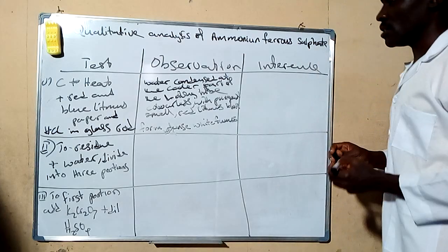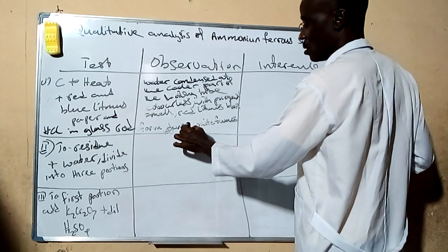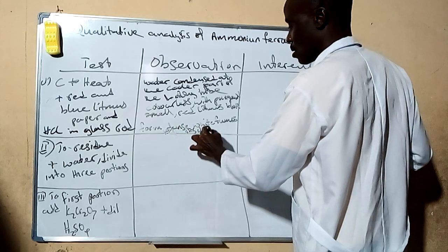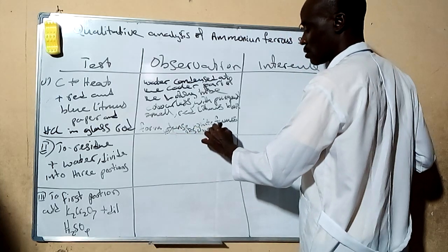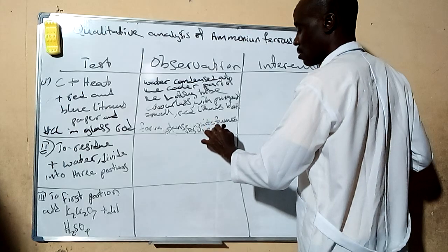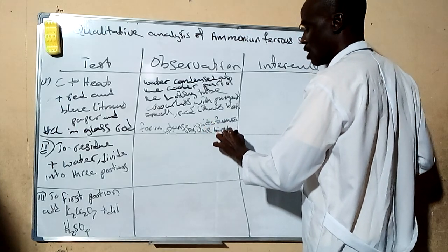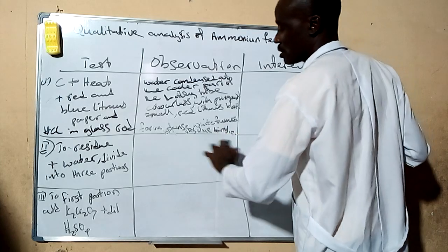The last thing is that the residue turns what? Yellowish green.